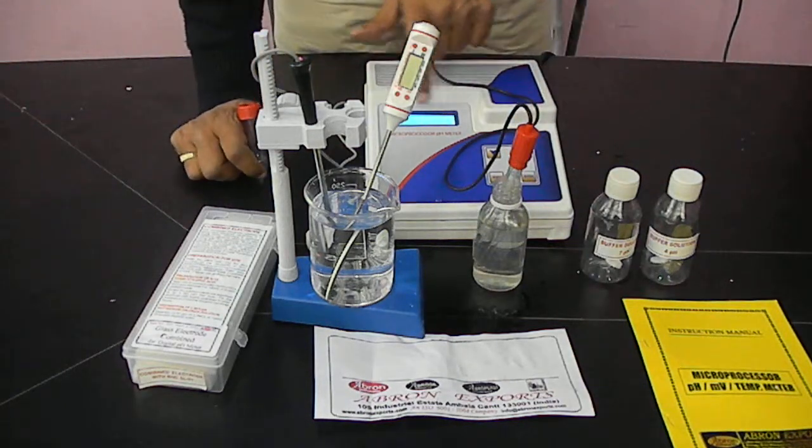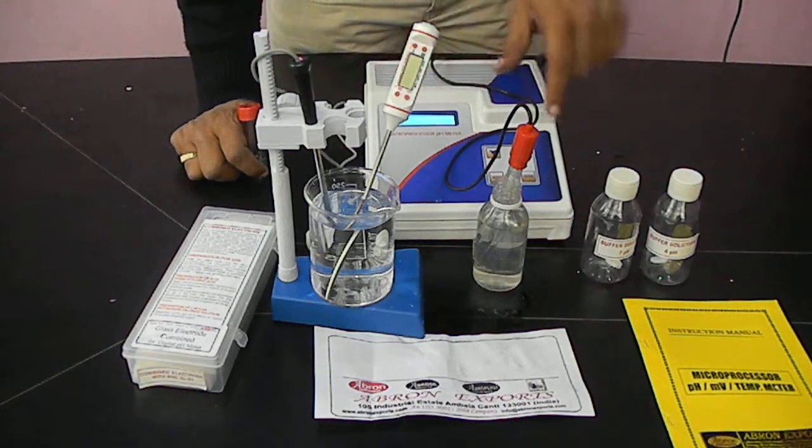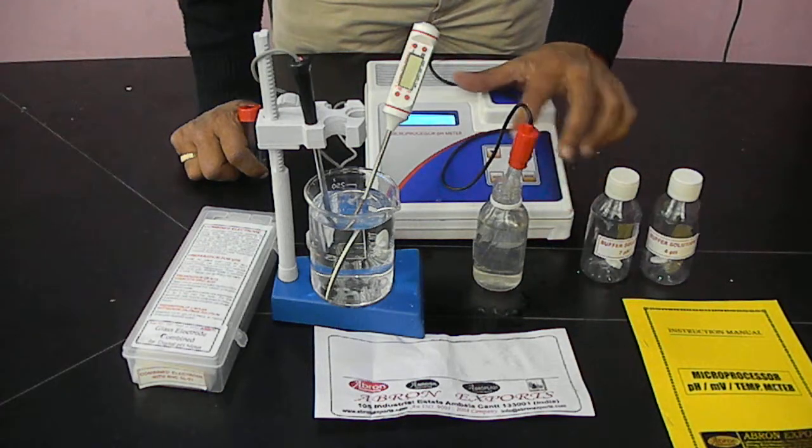We have a selection system here: pH, mV, and temperature. The mode can be selected by any mode button.